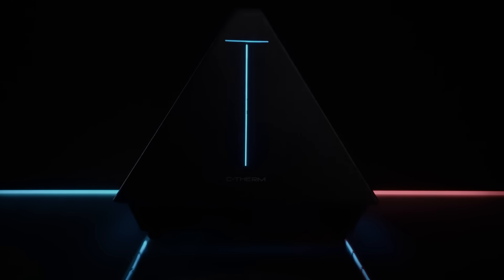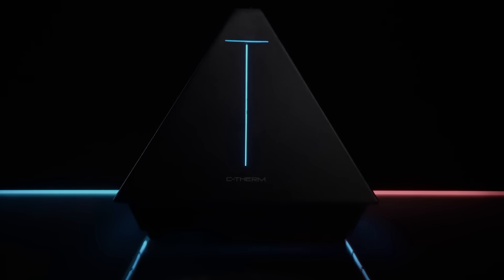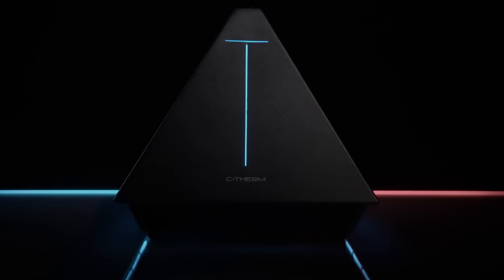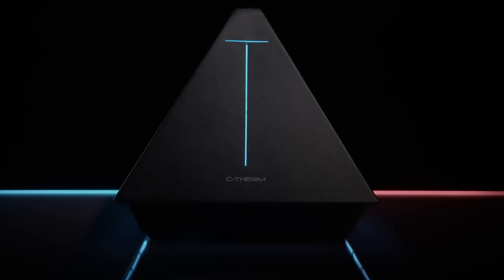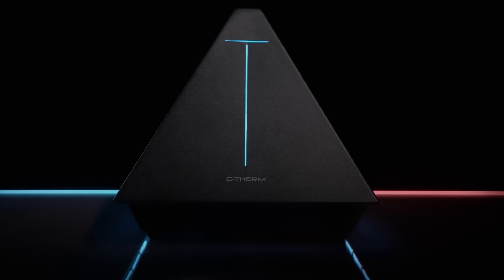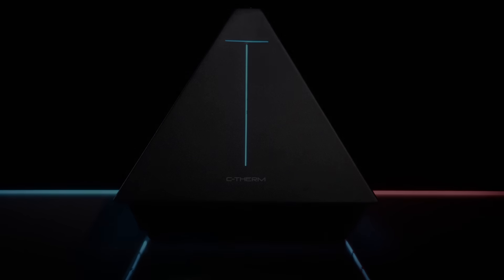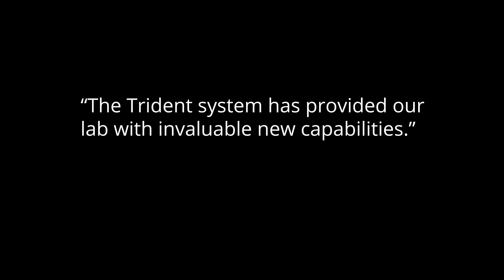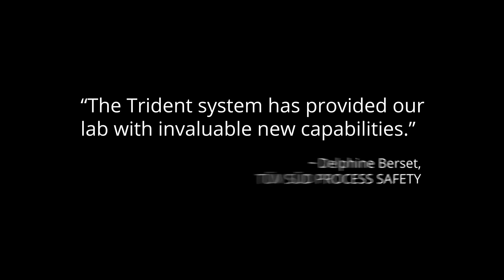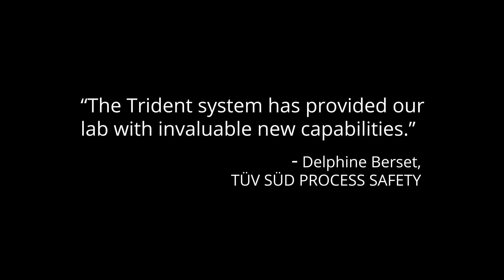Trident by industry leader C-Therm represents a new paradigm in thermal conductivity measurement, delivering three of the most powerful transient methods in one instrument. It's better to have options.